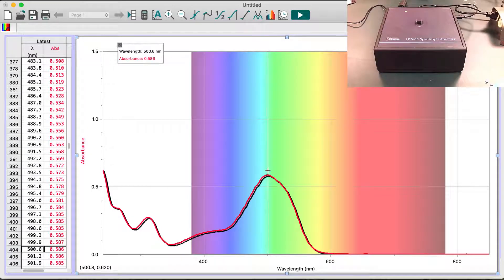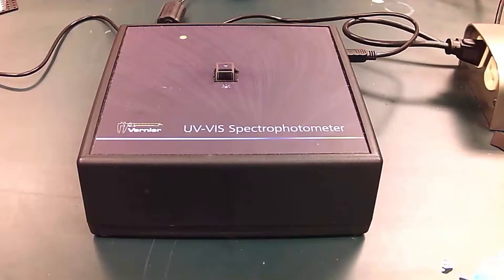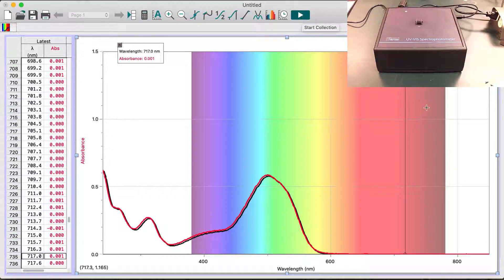Let's think a bit more about what 500 nanometers means. A photon with a wavelength of 500 nanometers represents green light — it's kind of on the edge between blue and green, but for our purposes we'll call it green. To show what I mean, I have a couple of laser pointers here. The green laser pointer is 530 nanometers, and emitting 530 nanometer photons makes a green spot. I have a different laser pointer that's red — it's 650 nanometers, and when you emit 650 nanometer photons you get a red dot. So our red food coloring dye is absorbing photons centered at about 500 nanometers, which are green photons. That's a really important point you'll think about in the lab.